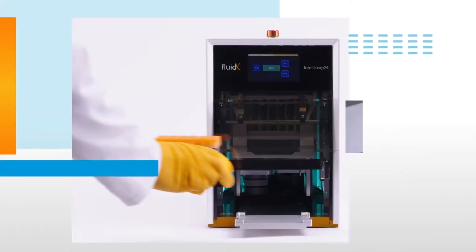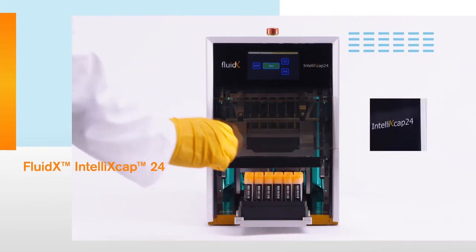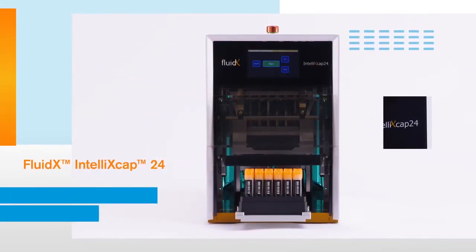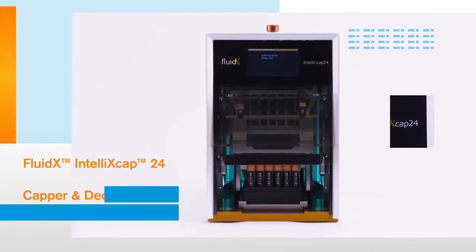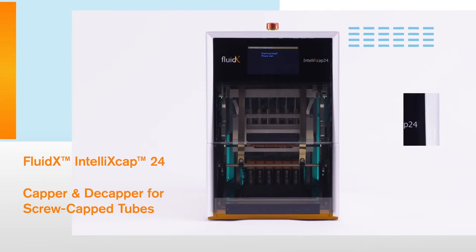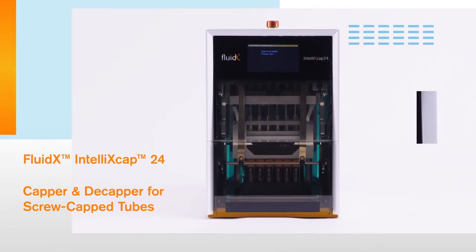In this video, we're taking a look at the Fluidex Intelli XCAP24, a whole-rack automated capper and decapper for screw-capped tubes in a 24-format SBS rack.